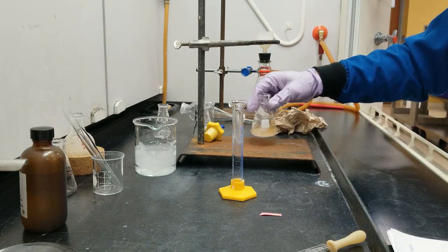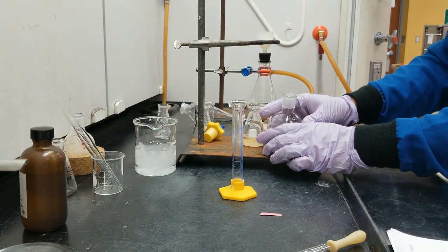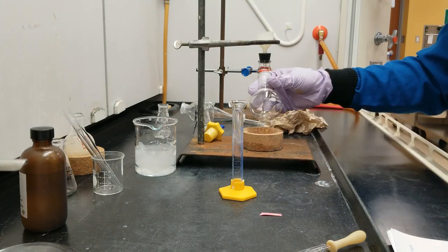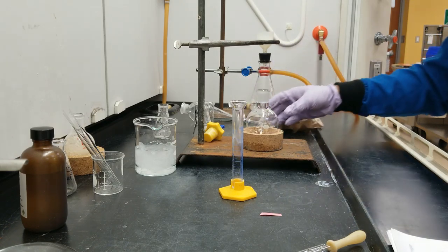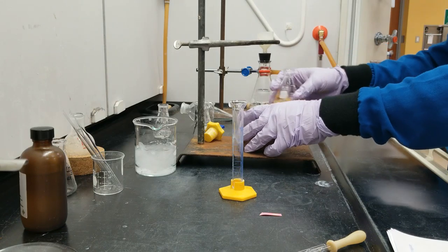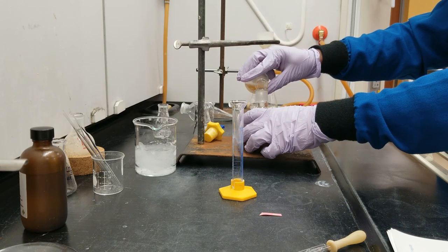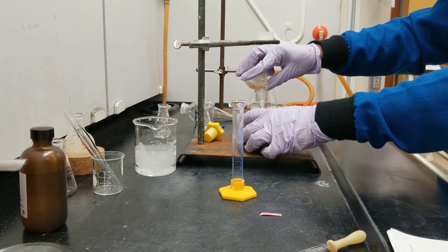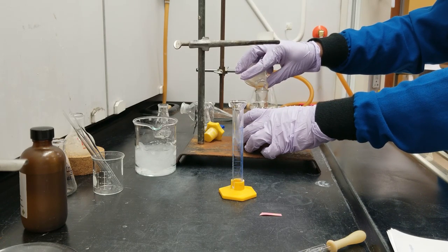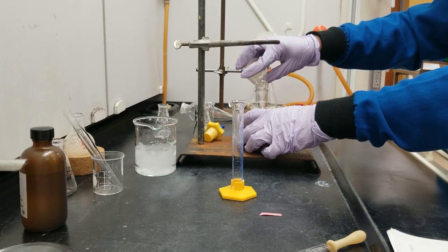The next step is to decant this organic layer into a pre-tared 100 mL round bottom flask. The weight of the round bottom flask is 82.89 grams. So I'm transferring the organic layer into the round bottom flask. Make sure that you don't put the solid into the round bottom flask, because it might interfere with the further procedure.